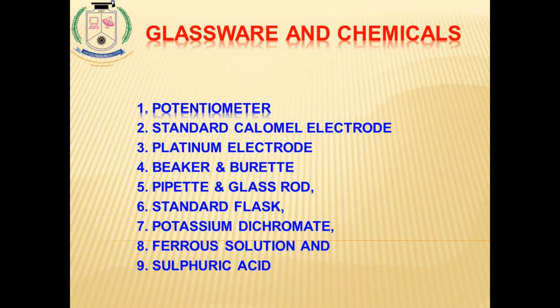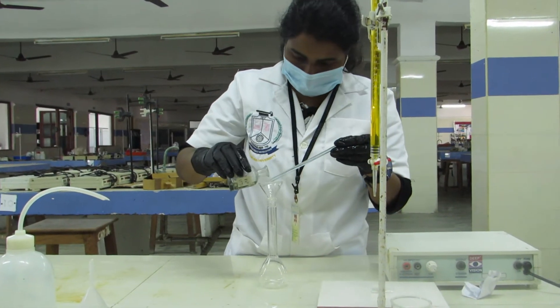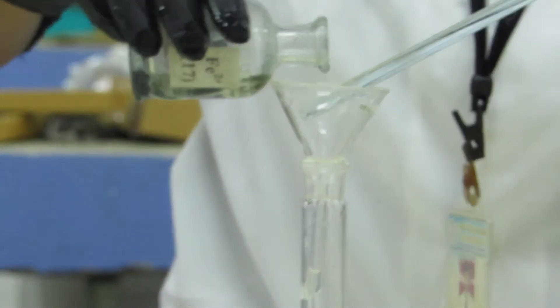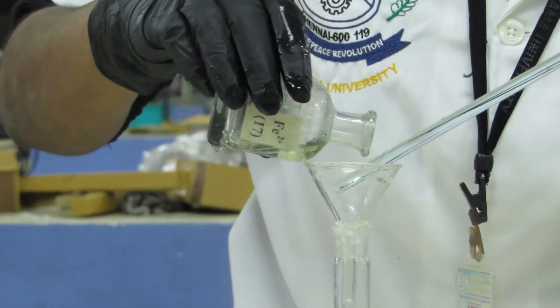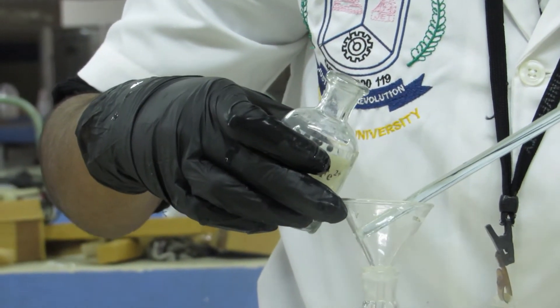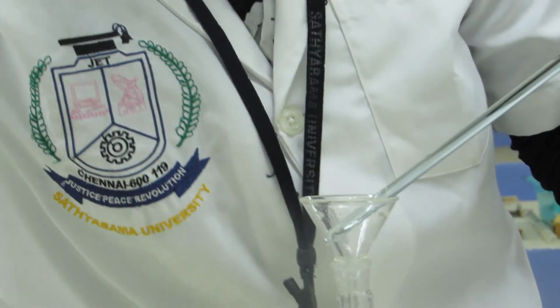It involves potassium dichromate and sulfuric acid for oxidation, and preparation of ferrous ion from the unknown solution. We are transferring the iron solution into the volumetric flask using a funnel and glass rod. This is the unknown iron solution. We are transferring it into the volumetric flask, and any remaining iron in the container, we will rinse with water and transfer again into the volumetric flask.